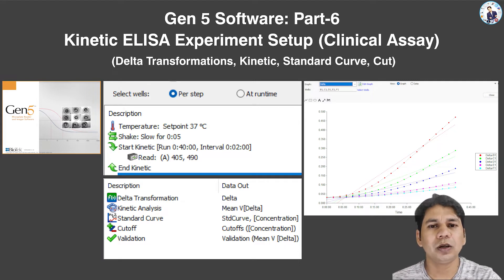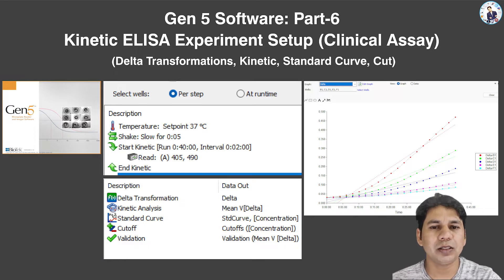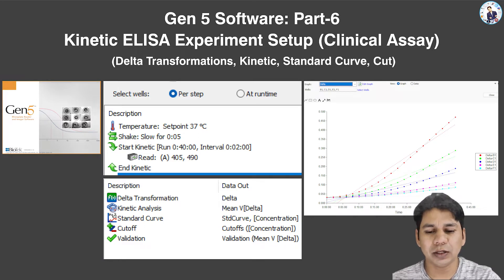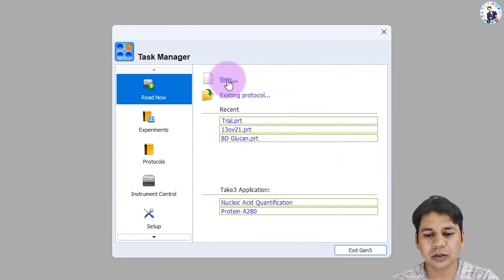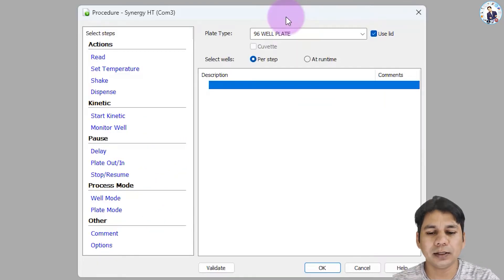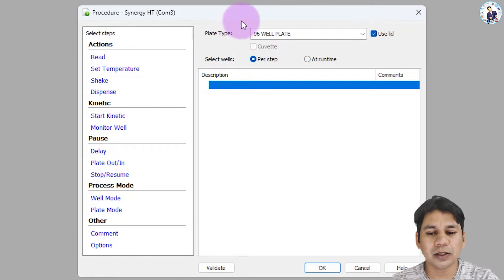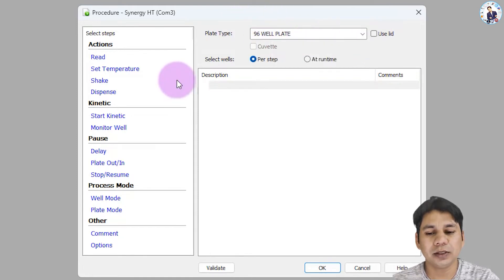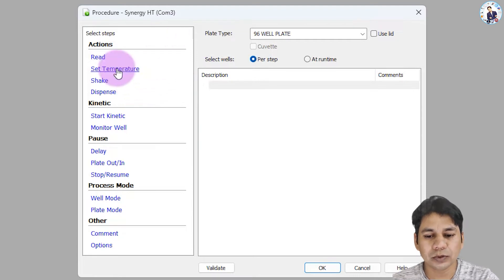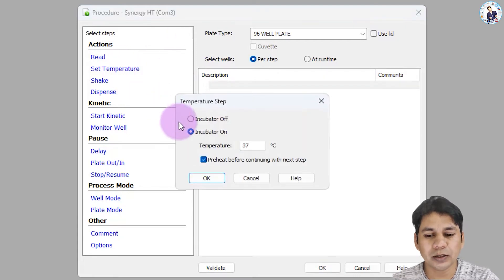I will show you how we can set up these types of experiments in Gen5 software. For a new experiment, click here. This clinical assay kit uses a 96-well plate, so I am selecting the 96-well plate and unchecking the lid option. The first step is to set temperature, so I am selecting the incubator.